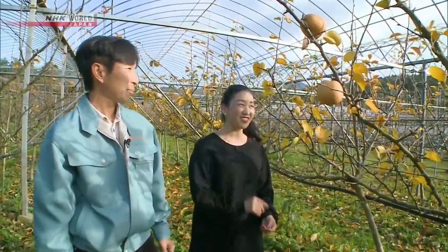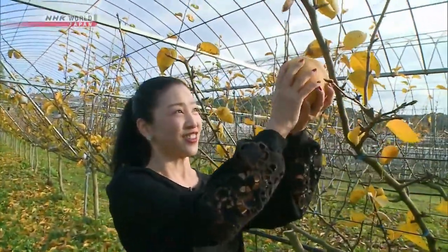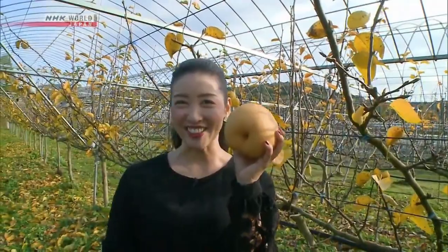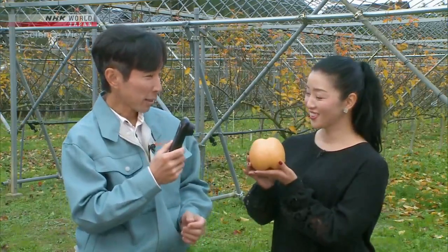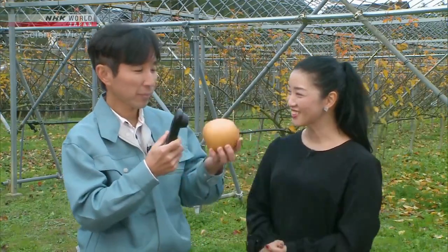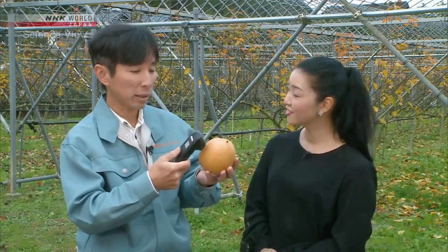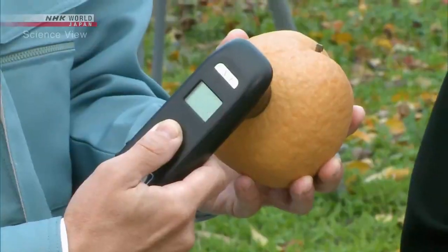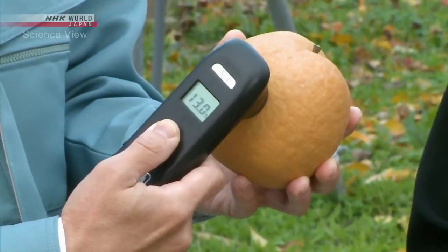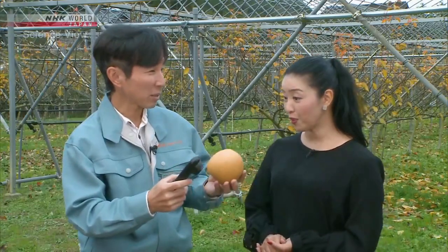Let's pick this pear and take it over there for testing. Now let's use the device. I can't wait. The device is supposed to be used inside, but since the daylight isn't too strong today, let's try it outside. 13 degrees. That fast?